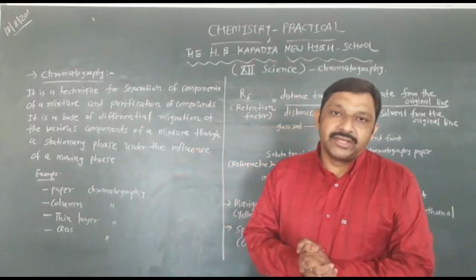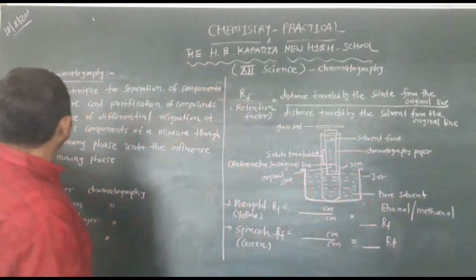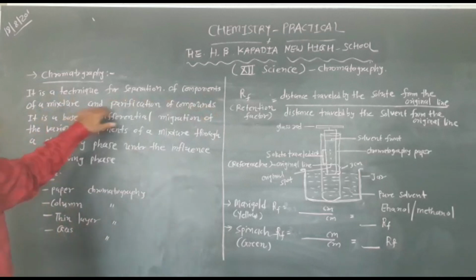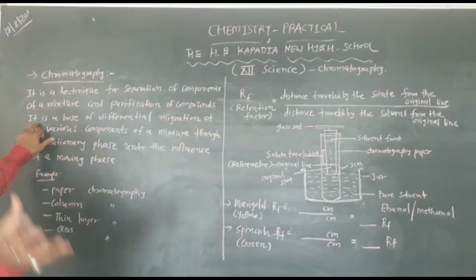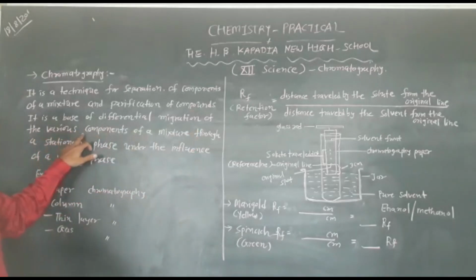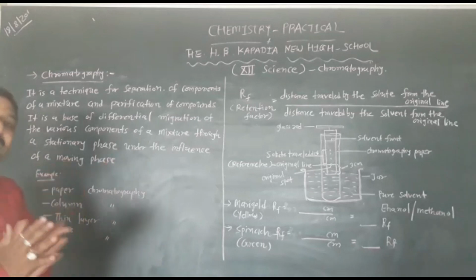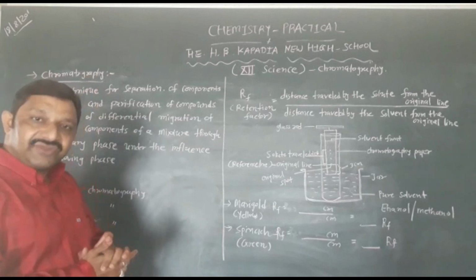Clear? Now look here. What is chromatography? It is a technique for separation of components of a mixture and purification of compounds. It is based on differential migration of the various components of a mixture through a stationary phase under the influence of a moving phase. So this is your basic chromatography definition.